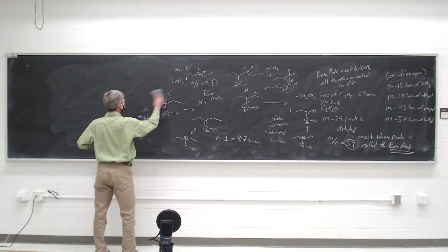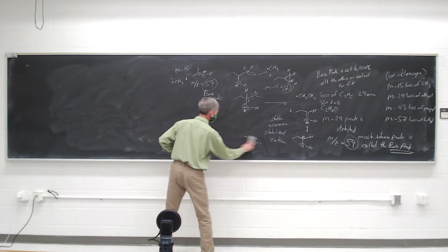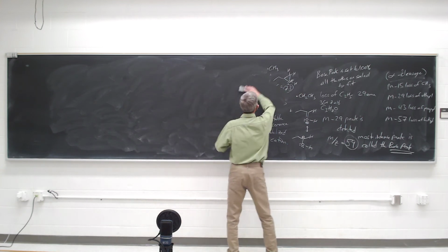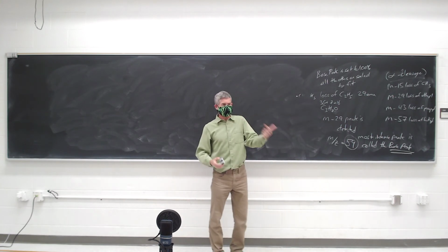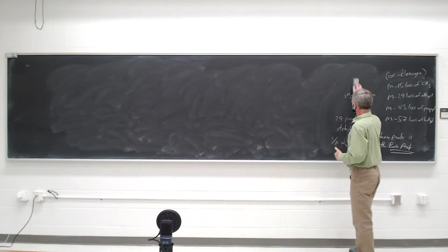So what about rearrangements? What kind of rearrangements do molecules do? What usually happens in a rearrangement is the radical cation, wherever that radical is, plucks a hydrogen off somewhere else in the molecule to spit out a neutral molecule.